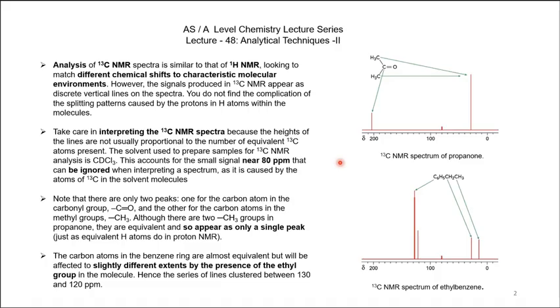But to continue this, today we will take a few very subtle points of interpreting the spectrum of molecules. Here we will see in this slide the carbon-13 NMR spectrum of propanone. And here is the propanone molecular arrangement, the molecular formula of propanone. And now we have to interpret this.